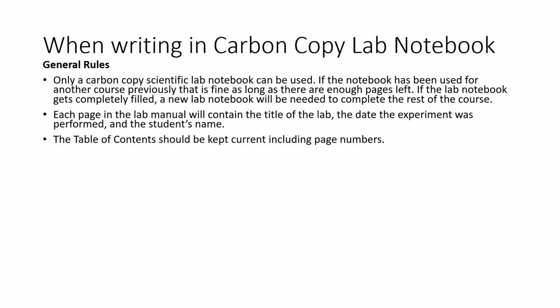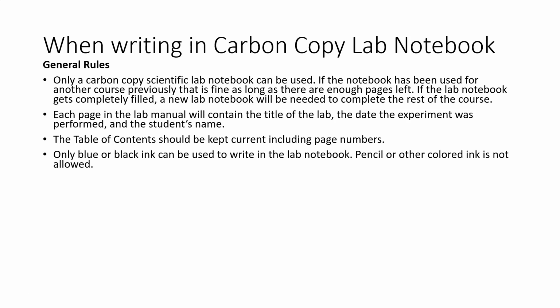Your table of contents, which is in the front of every carbon copy lab notebook, you just need to update as you perform experiments. Once you finish the first lab, go to your table of contents, write the title of the lab, write the page numbers in your carbon copy lab notebook that it was over, and then just keep updating that throughout the semester.